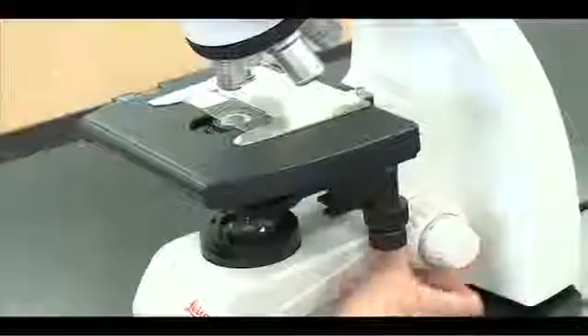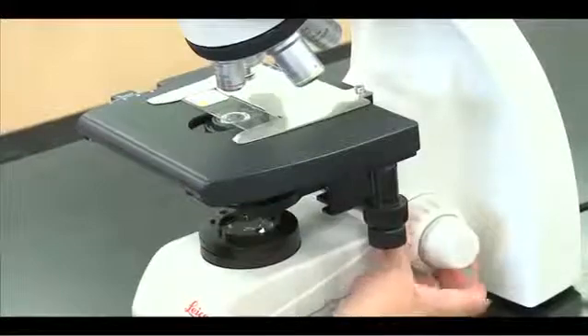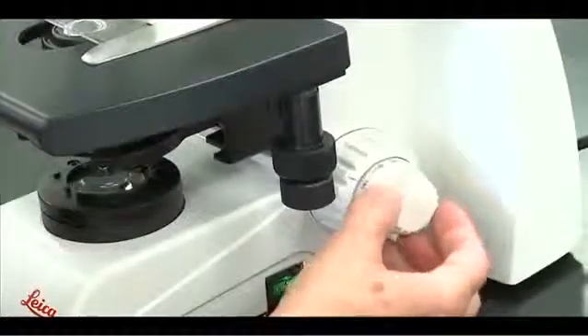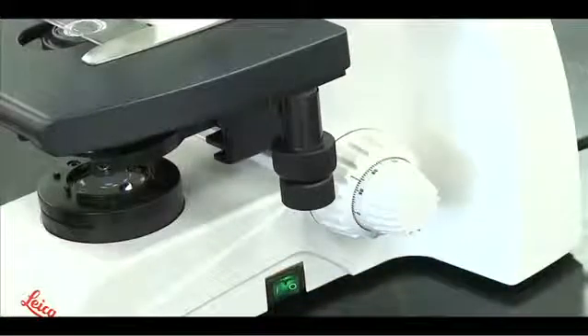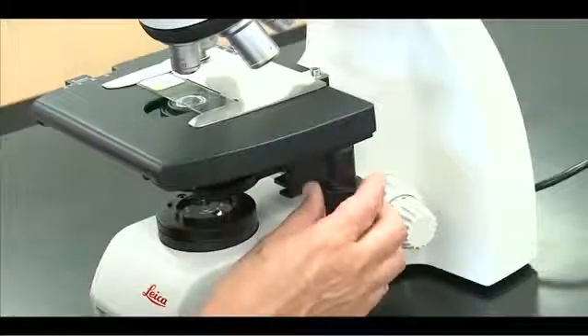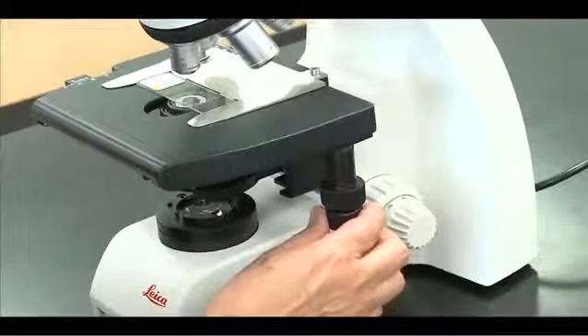Use the coarse adjustment knob to raise the stage all the way up. Use the fine adjustment knob to lower the stage until the slide is in focus. Use the mechanical stage controls to scan your slide.